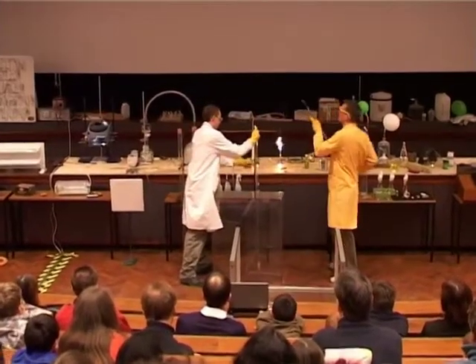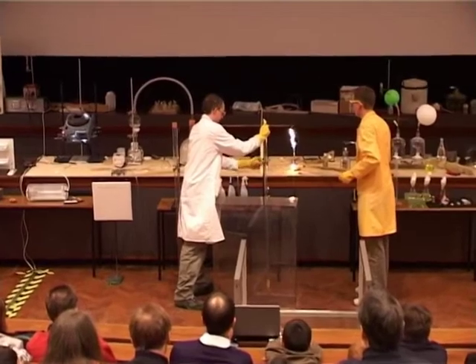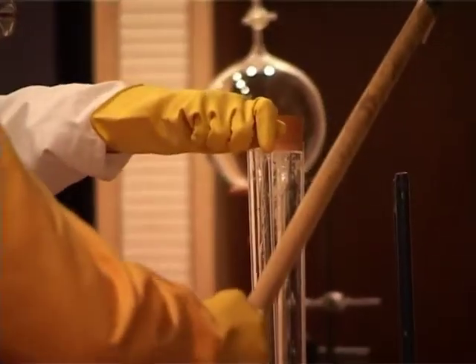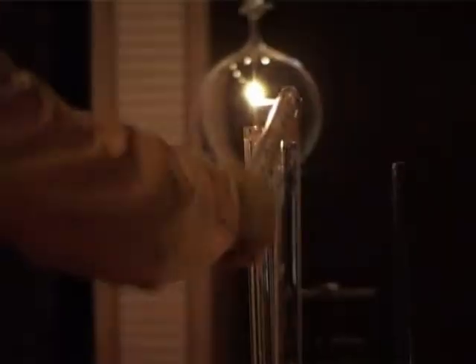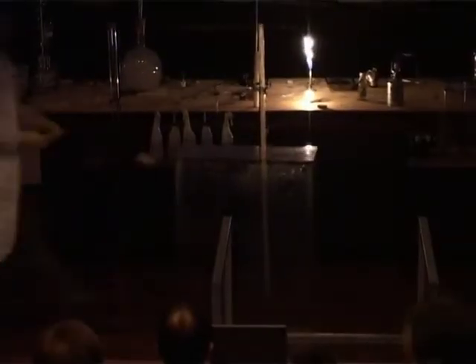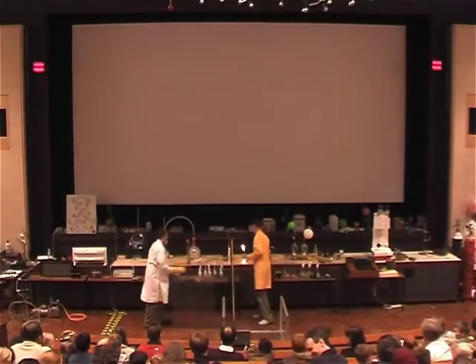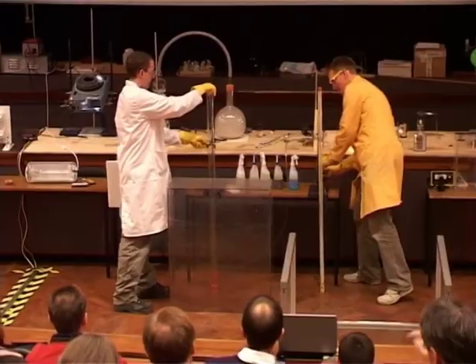So we're mixing these two reagents together, and in a moment we're going to apply a light to the top and you should see some light forming. Just in case you missed that one, we'll try a slightly bigger one.